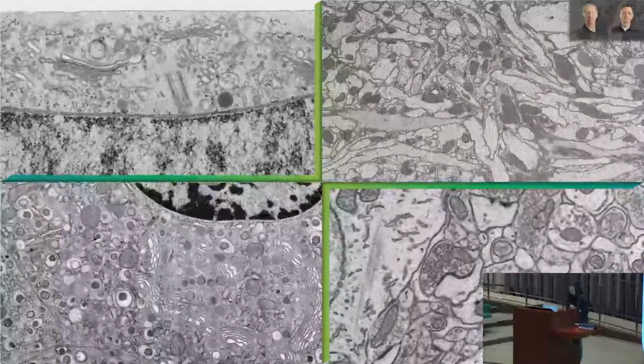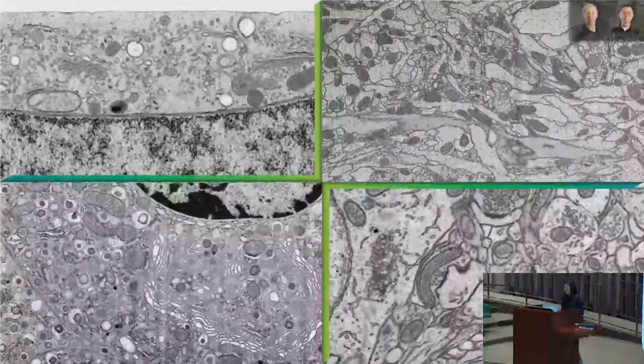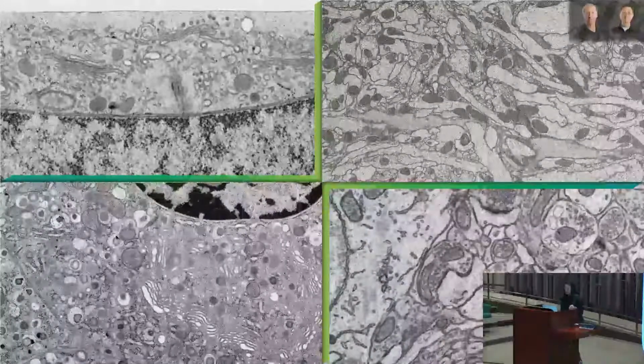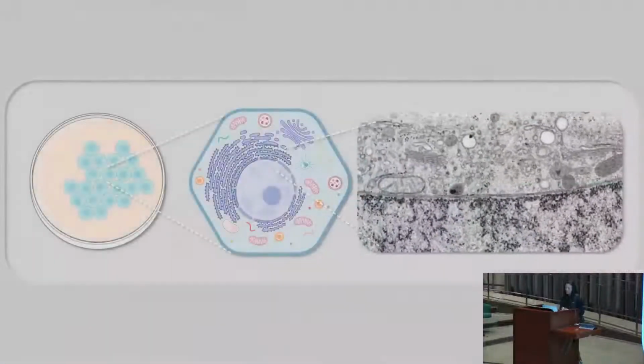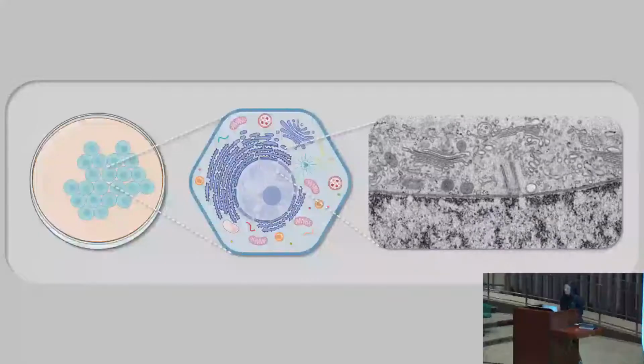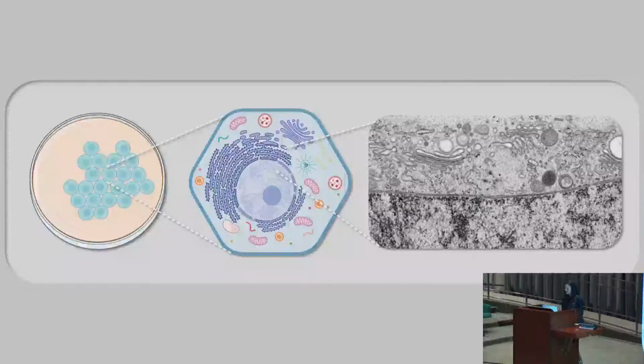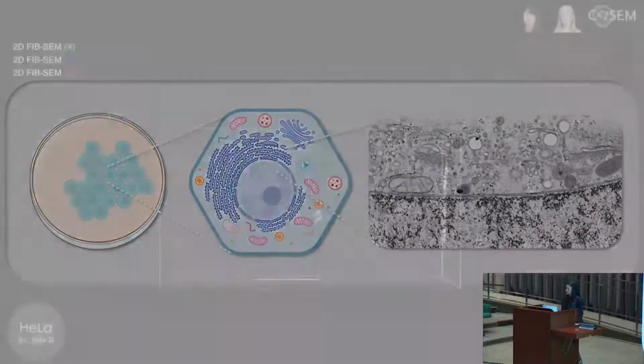So to start to attack this, the CellMap project team worked to develop a machine learning pipeline to automatically segment organelles and cellular substructures within these data sets. We started at the beginning with a single cell, and we used existing data sets that the Hess lab had produced of conventional immortal cell lines to develop this proof of principle pipeline.